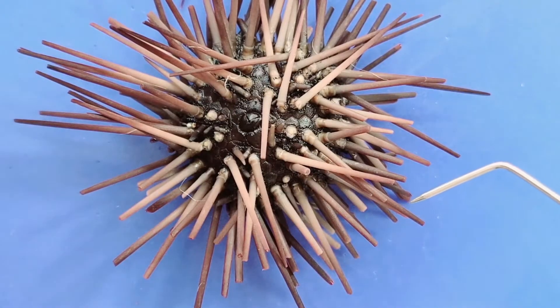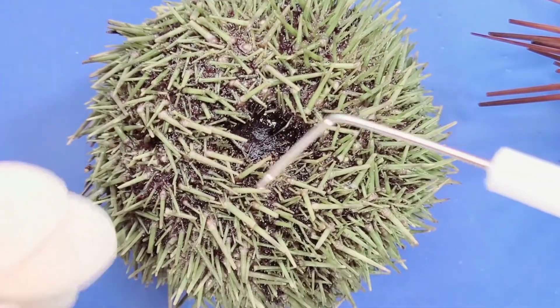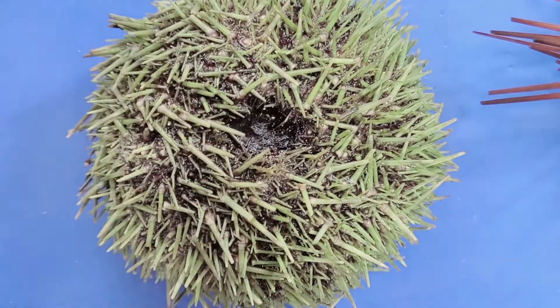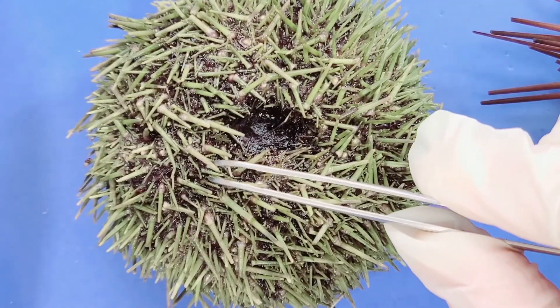On the green sea urchin, you can also see spines that move. It's a bit harder to see here because the spines are shorter, but you can see that they move.